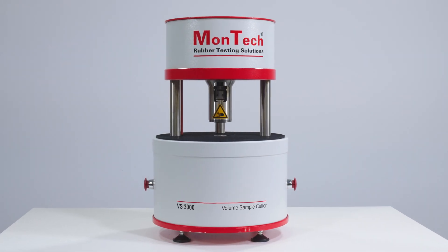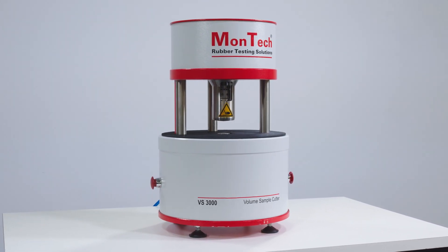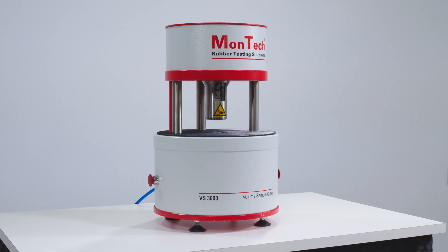The Montec RVS3000 Volumetric Sample Cutter quickly and easily prepares test samples for use in rayometer testing. Using samples prepared with the RVS significantly reduces operational variability and increases reproducibility by providing consistency and accuracy in the volume of the test samples.